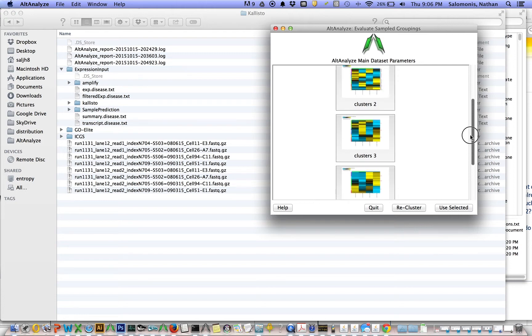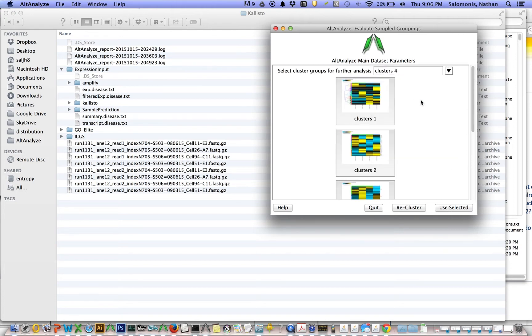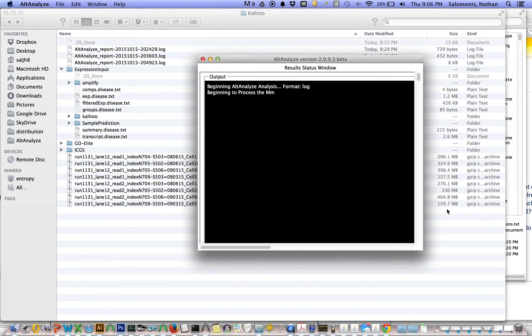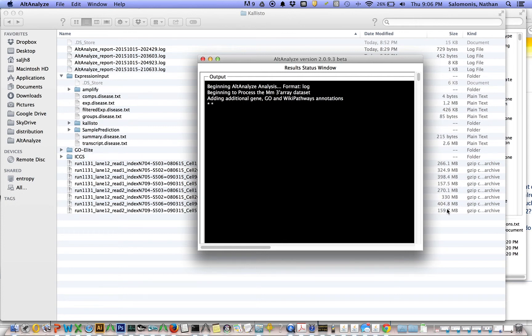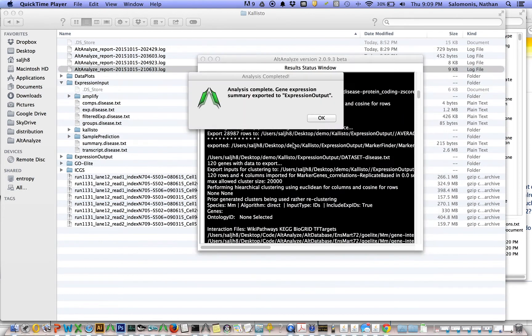So we just say use selected. Actually first, we need to select clusters for, or by default it uses cluster one. And we say use selected, and it's now going to run a series of additional analyses using the parameters we set out at the beginning of this.